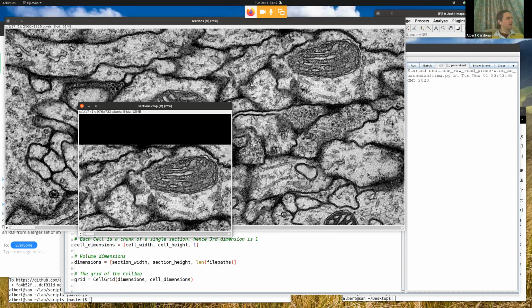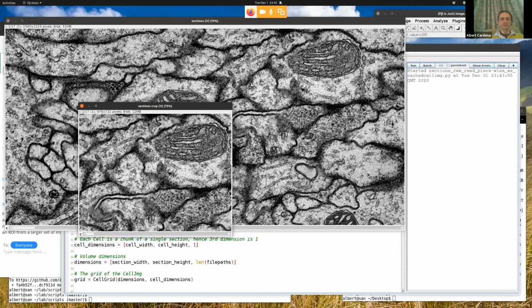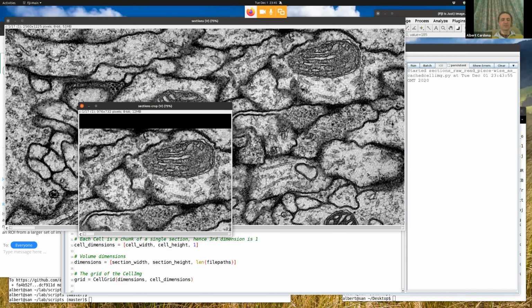And so think of it as some kind of region of interest that you move over your image. But actually, what you have in here is an ImageJ stack. So if this is an ImageJ stack, you can run plugins on it, you can run machine learning on it, you can do all kinds of things on it. But as you do that, it is non-persistent.